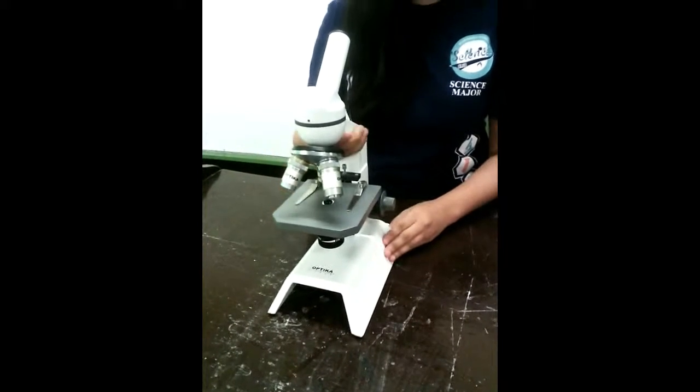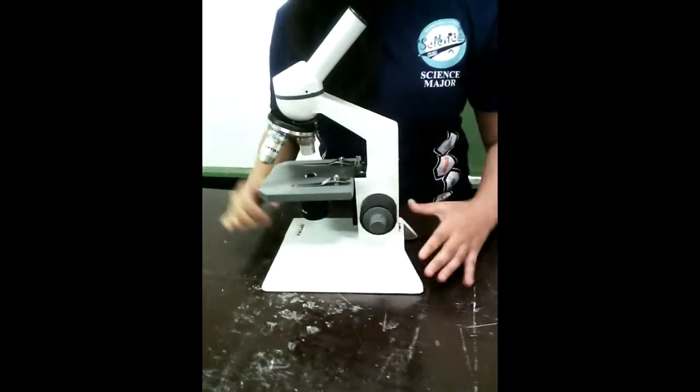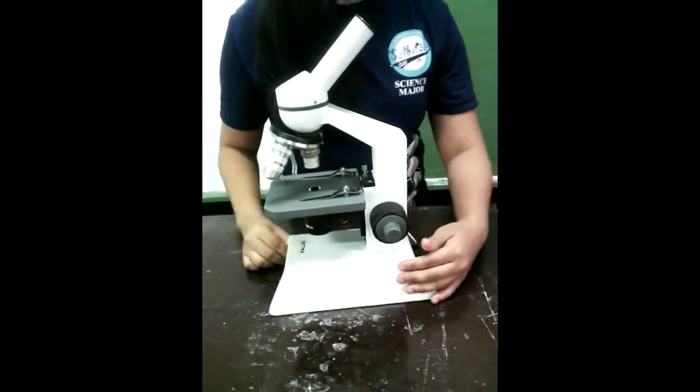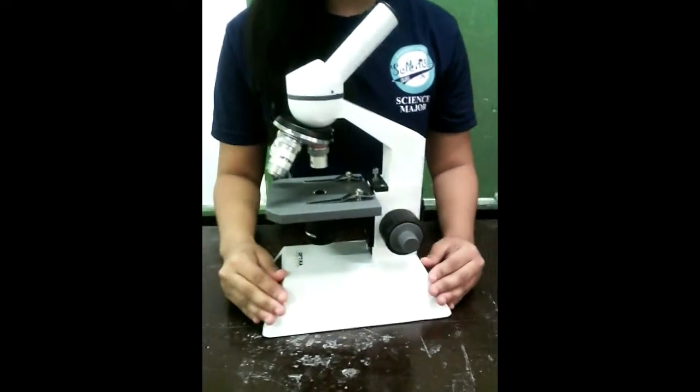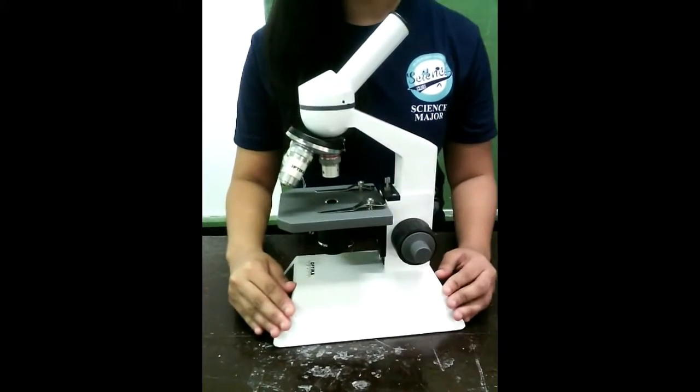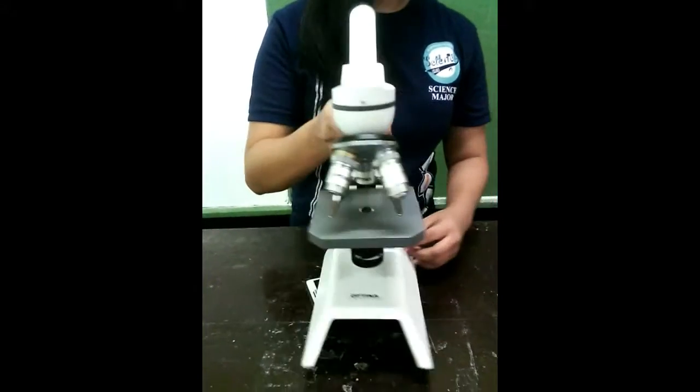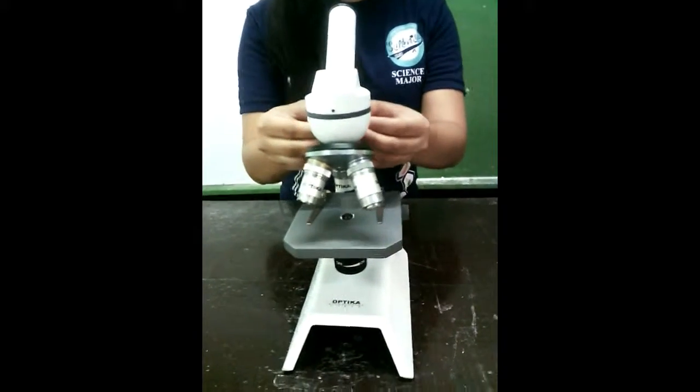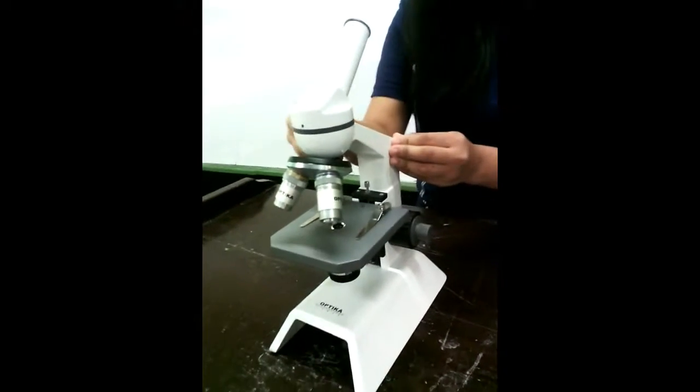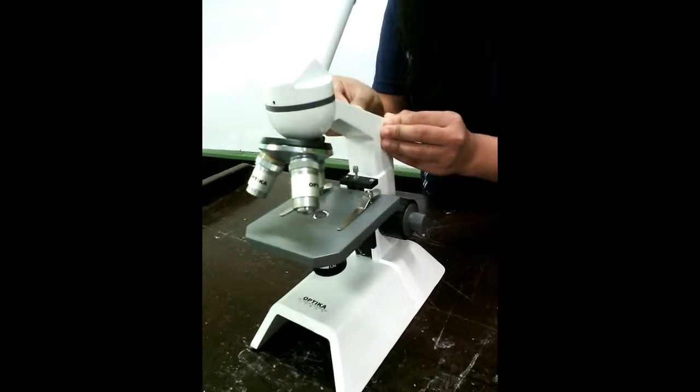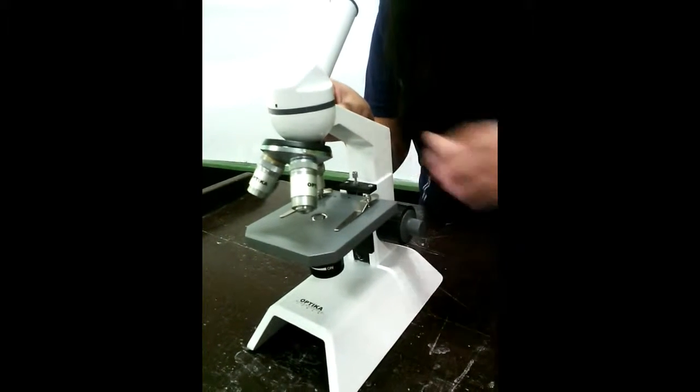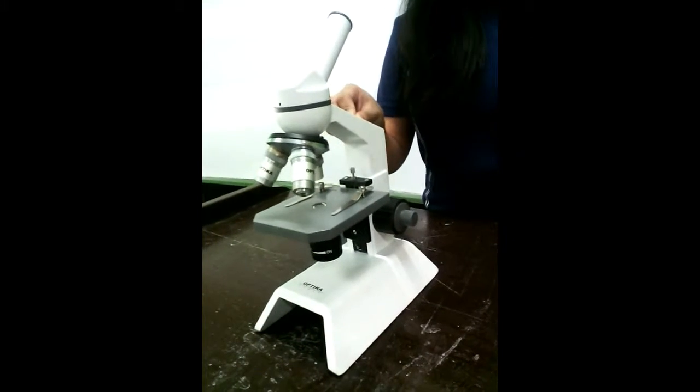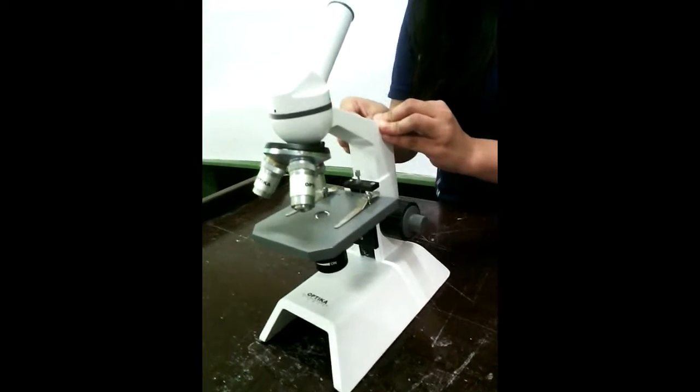This is the base. This is the base of the microscope. This is where the microscope firmly rests. This is the arm of the microscope, in which the arm connects the base and the body tube together. It serves as a handle for compound microscope in carrying the microscope.